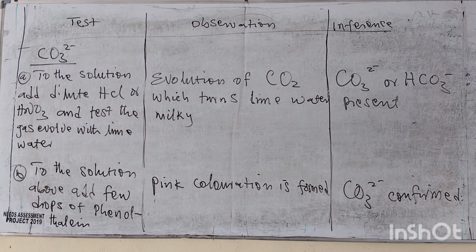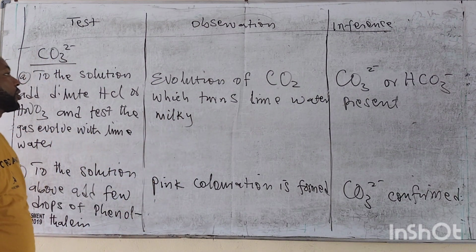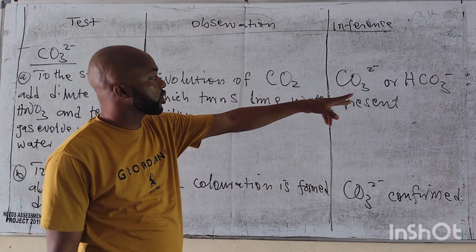There is evolution of CO2 which turns lime water milky, is our observation. So we have CO3 2- or HCO3- present.